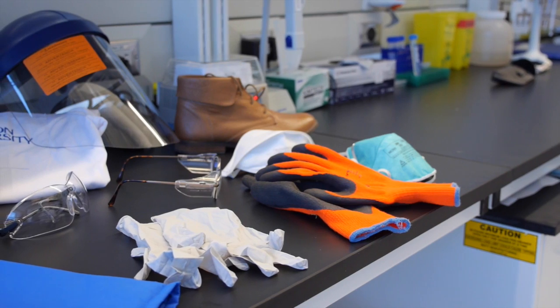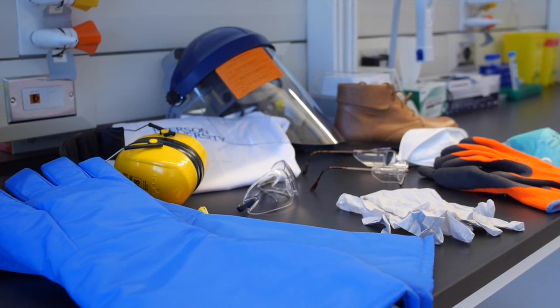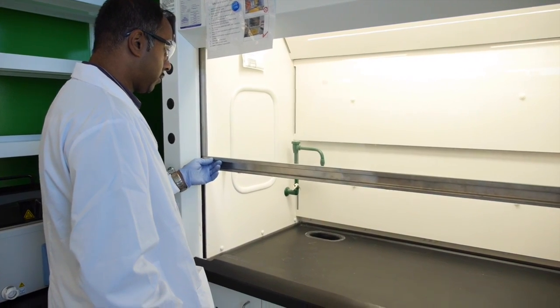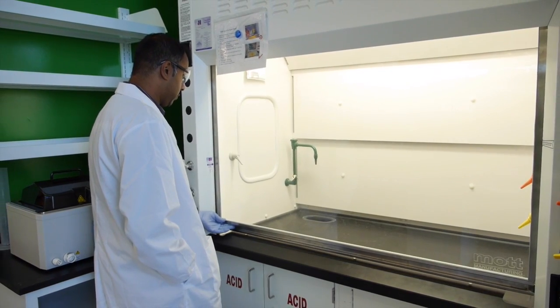When you operate a fume hood, you should always be wearing the appropriate eye and face protection, respiratory protection, gloves, and lab coat. Fume hoods should be evaluated by the user before each use, to ensure that they are in proper working condition.